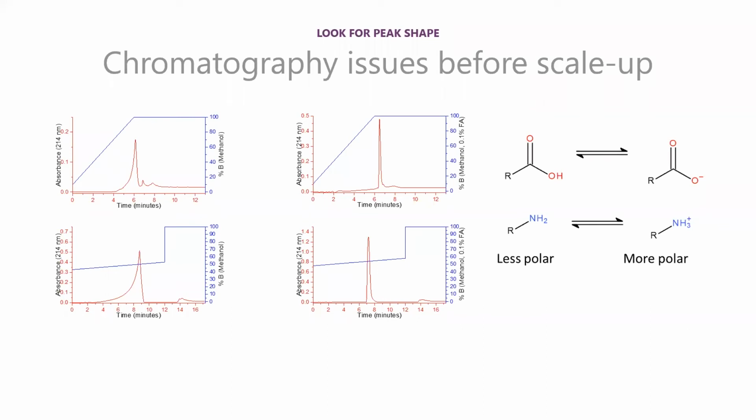The idea is to force the compound to be in one form or another, either all ionized or all as the free acid or base.